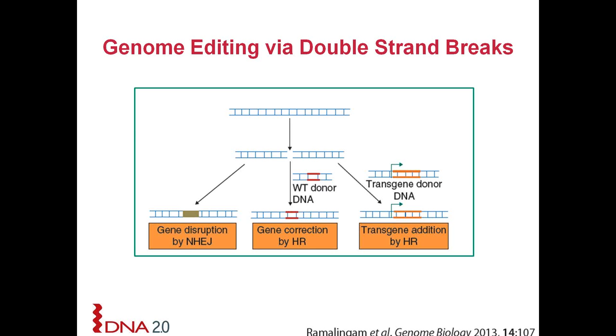Great. Next question. Can you compare the off-target site cleavage frequency between the Nickase and the regular CRISPR vectors? We can compare, and experiments here are underway. So there are 2 ways to do that. One is you look for predicted off-target sites that are known to be 1, 2, 3 bases off, and you look for what happens there. The other is you just screen the entire genome of an organism by next generation sequencing and see what actually happened at any site, and compare frequencies of on-target activity versus off-target effects. We have experiments underway, and we're trying to look into that and compare those things.